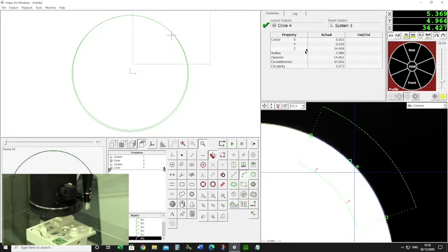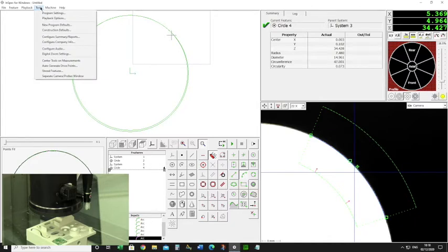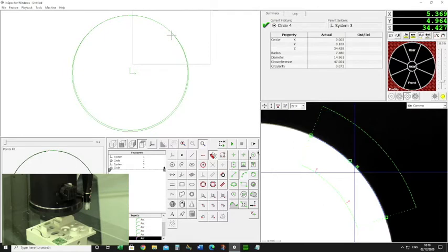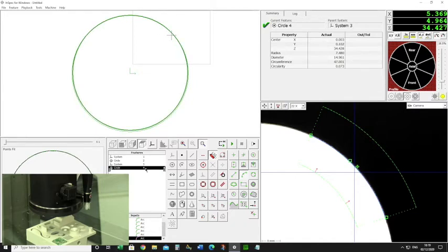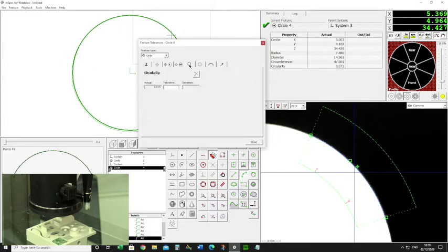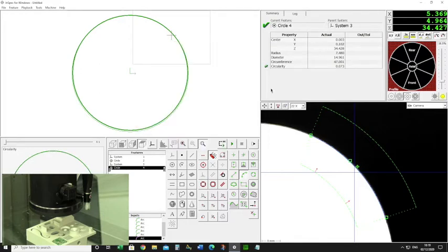If it's not showing on your summary window, go to Tools and configure summary and reports, and from there you can simply turn it on. If we need to get this value into our report, we need to give it a tolerance. Click on the circle, go to the tolerance menu — press F3 on the keyboard — then go to the circularity tab and type in the tolerance. I'll say 0.1, and you can see it puts in a deviation. We get a green tick in circularity and that will also output to our report.